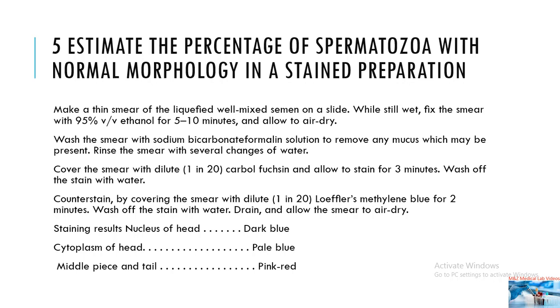Cover the smear with dilute 1 in 20 carbol fuchsin and allow to stain for 3 minutes. Wash off the stain with water. Counterstain by covering the smear with dilute 1 in 20 Loeffler's methylene blue for 2 minutes. Wash off the stain with water. Drain and allow the smear to air dry.